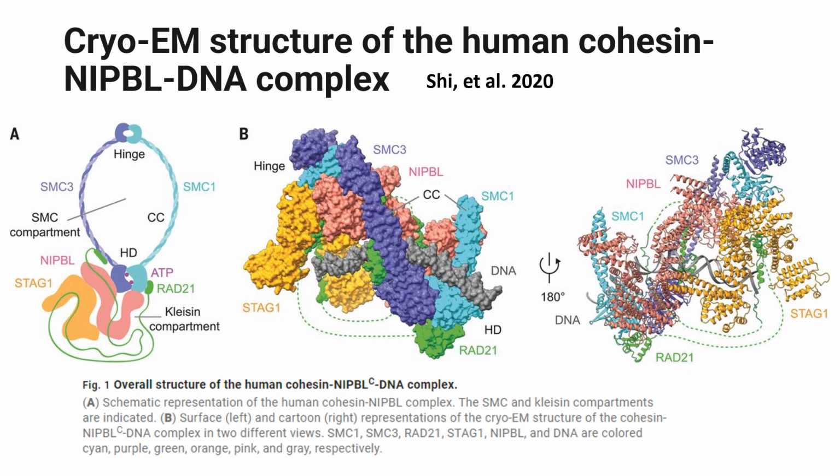To examine how it does these tasks, the authors determined the structure of the cohesin complex bound to the DNA loader NIPBL and DNA. NIPBL is shown in pink and DNA is in gray, and everything else is part of the cohesin complex. Cohesin and NIPBL form a tunnel that traps the DNA. The structure also engages cohesin's ATPase head domains and promotes ATP binding.